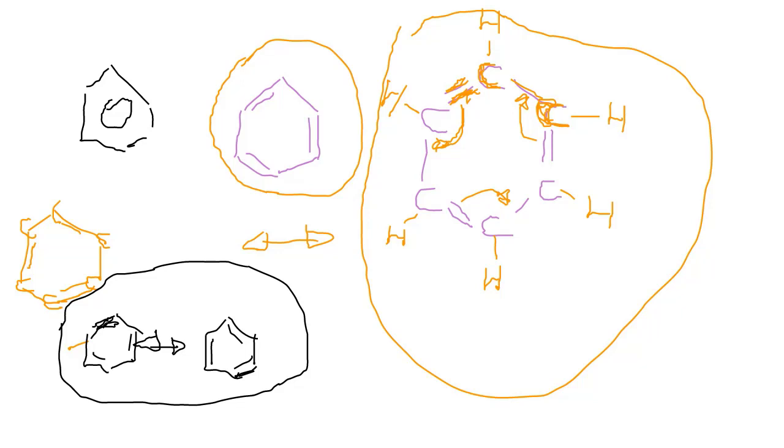That is important. That means even though they are unsaturated, the reactions that you will see or the qualitative analysis that we will see in this experiment will be different from the alkenes or alkynes, even though all of them are unsaturated hydrocarbons.